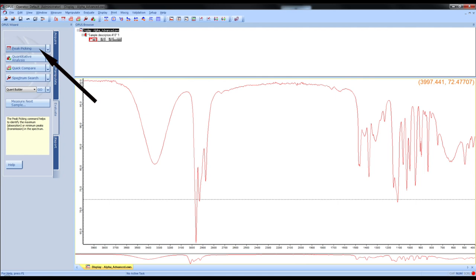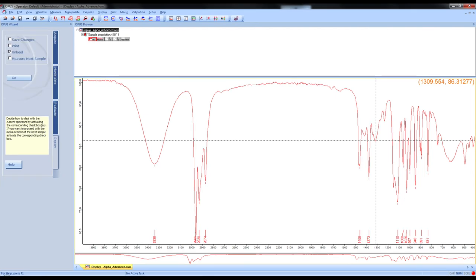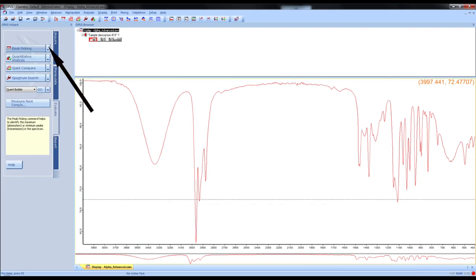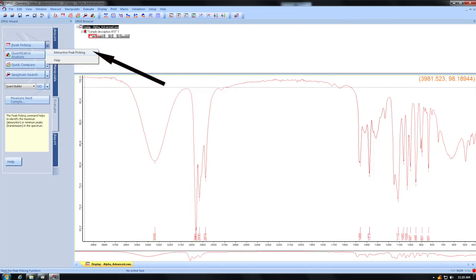Peak picking shows you the wave numbers for each peak. If your spectrum does not show all the wave numbers you want, choose the arrow beside peak picking and choose interactive peak picking.